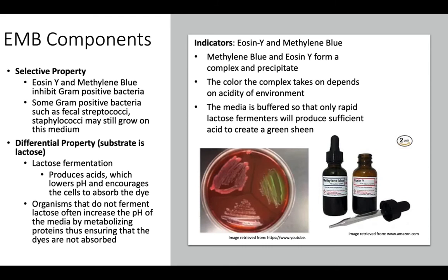This media is buffered so that only rapid lactose fermenters, so those that get in there and they're like, heck yeah, I'm going to use this lactose now, not as a last resort, will produce sufficient acid to create a really green sheen. If you remember, maybe I'm too old, but perhaps you saw the book Rainbow Fish, how it was kind of iridescent.